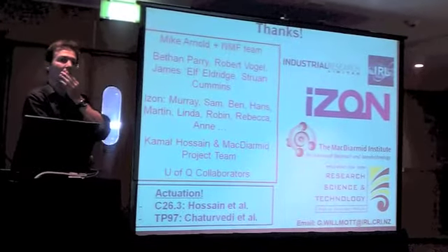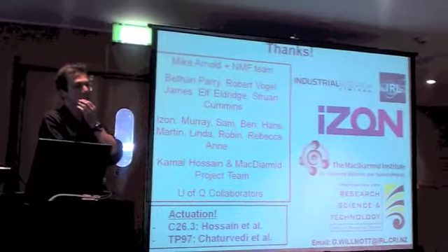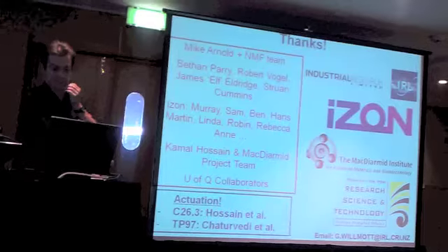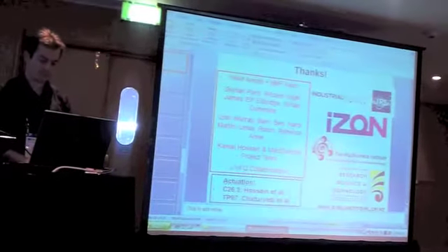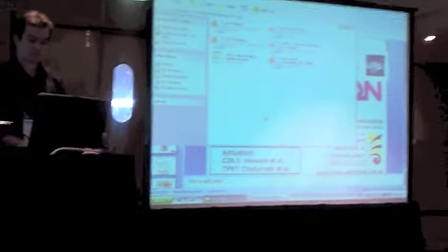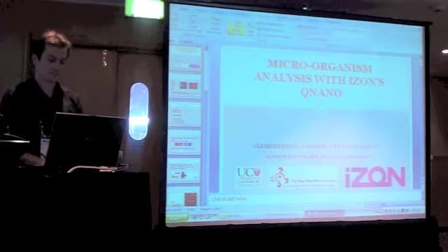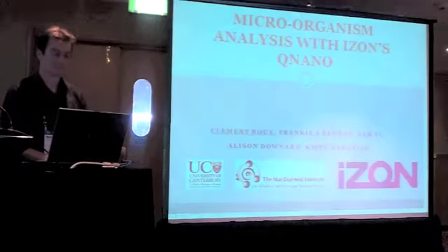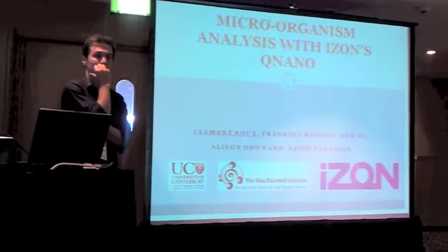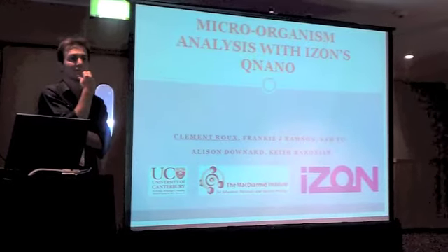Hans? Victoria University is doing some work looking at when a particle is gated. You can tune the hole down a bit, and all of a sudden the particle will just stop going through. The notion was to use some of your earlier work to try and predict the size of a hole. So the idea was to gate a 400 nanometer particle in a 200 nanometer hole, and you rerun 200 nanometer particles, and then use a formula to try and back calculate the size. I think what will happen is that the gating occurs very close to that point that you mentioned, where it goes non-linear. Well, it'll be very interesting to see. Yes, we'll know what the market is.